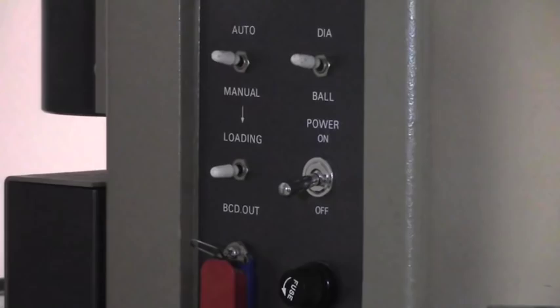On the left side of the machine you can find the control panel. This is where we will turn the machine on. Make sure that the other switches are set to auto, dial, and the loading BCD switch will not be used.